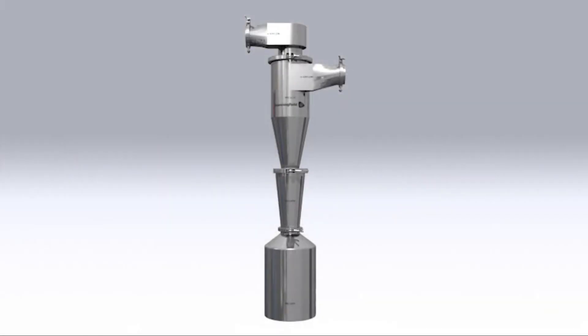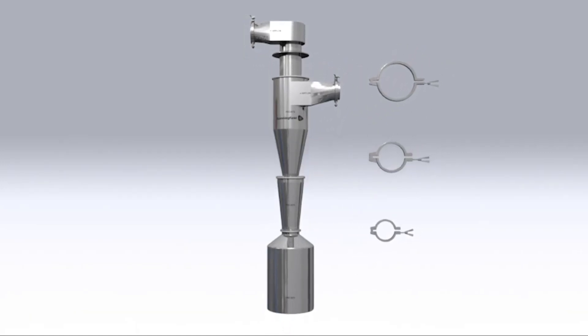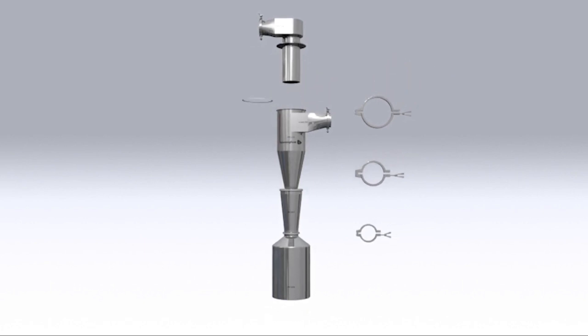The Unidust Cyclone has no filters, no moving parts, and is specifically designed for GMP environments. The unit is constructed from 316L stainless steel using tri-clover connections for quick dismantling and ease of cleaning.